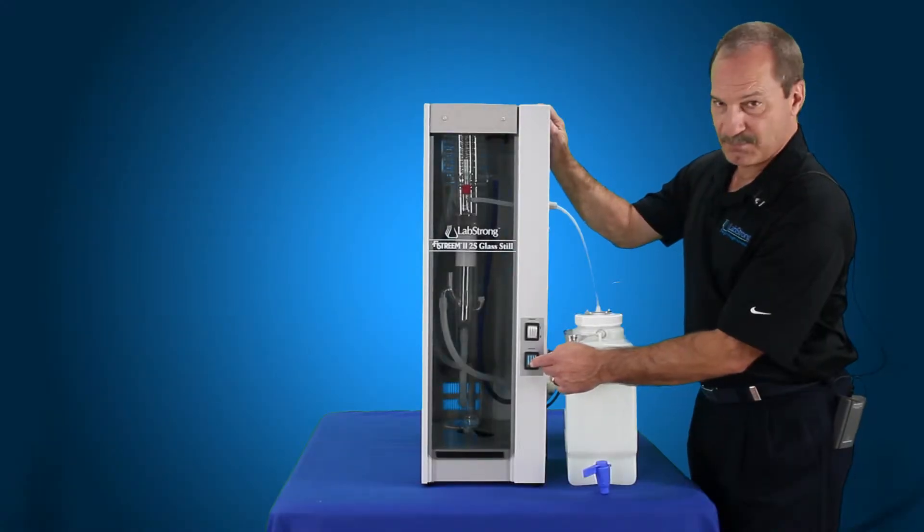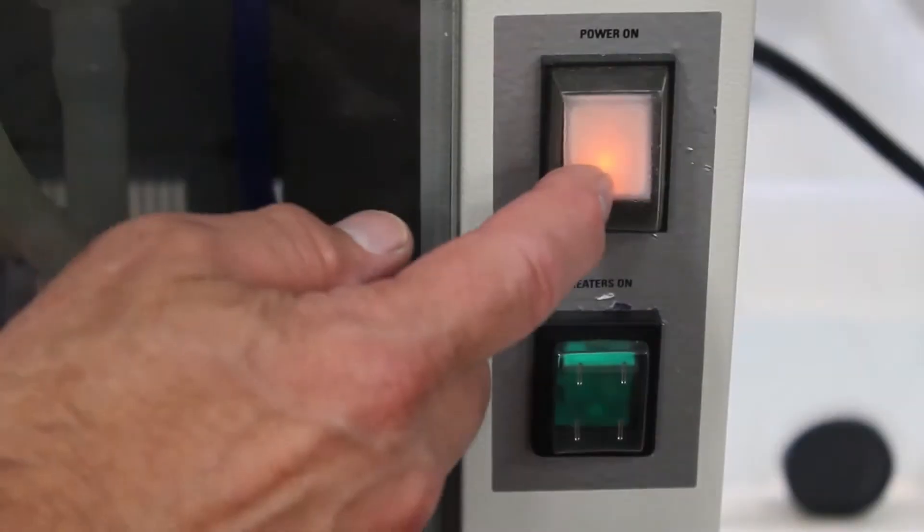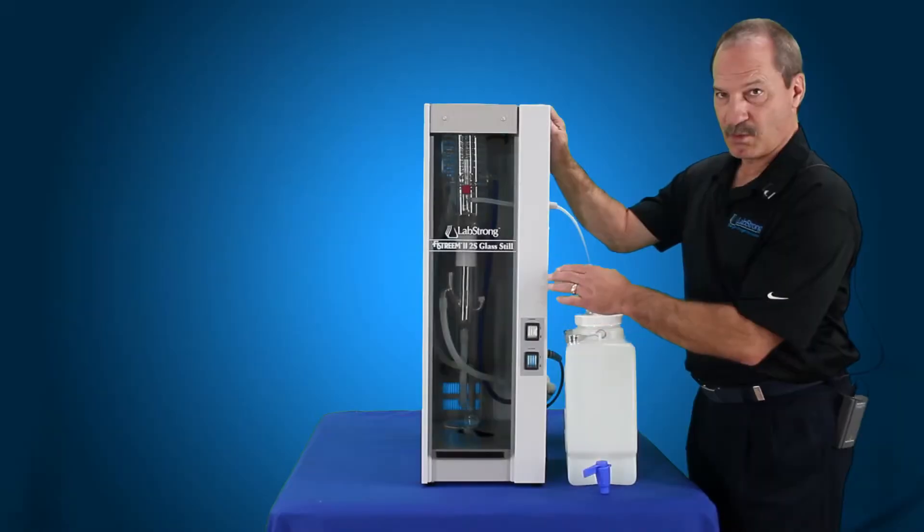First thing you want to do is shut off the heating elements, which is the green heater switch. Then you want to shut off the incoming power to the solenoid valve so no more water comes in.